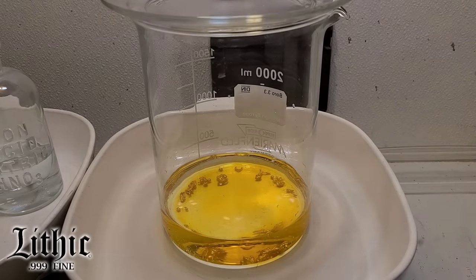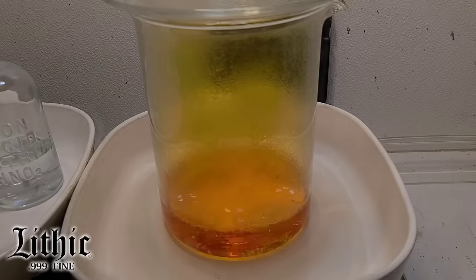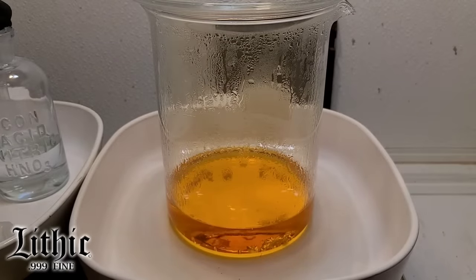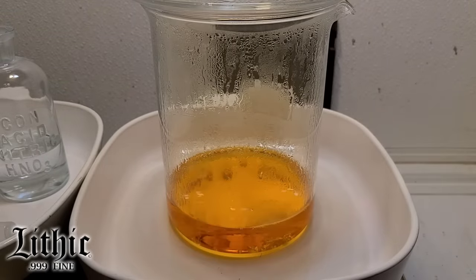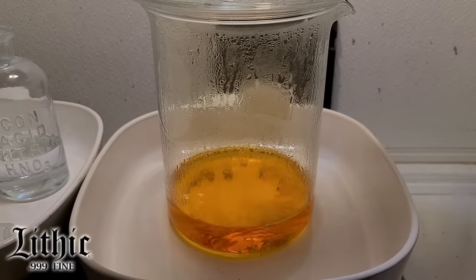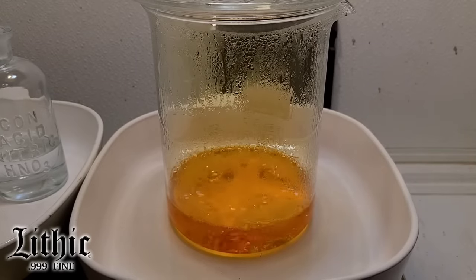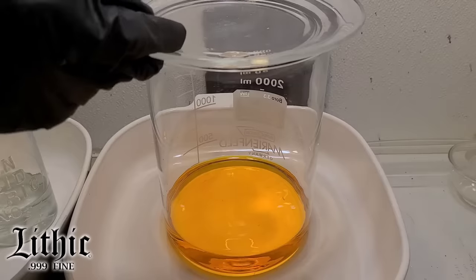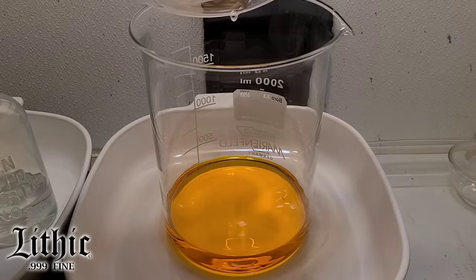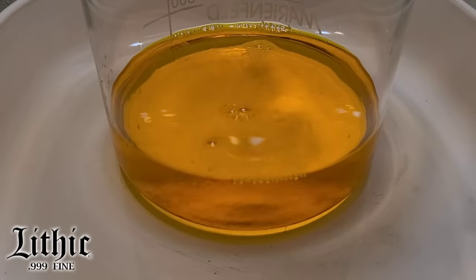Now this gold is still super, super clean — it's still 99 point something percent pure gold. It just has just enough silver, copper, or whatever it was that contaminated it, just enough that it's not suitable for a Lithic bar. So I'm putting this into solution. I kept adding nitric acid until all the gold went into solution. And here we are — I just added a bit of distilled water.